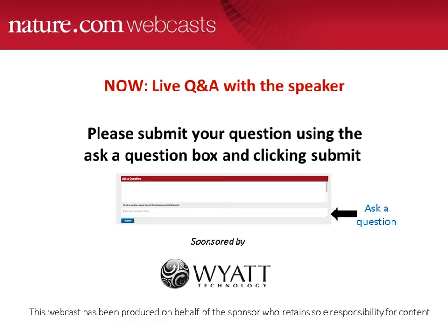Excellent. Thanks, Eva. And our next question asks, how do you determine the frictional ratio in DLS experiments? So this is a combination of both DLS measurement to measure hydrodynamic radius and static light scattering measurement to measure molecular weight, because one needs both of these to compute the frictional ratio. From molar mass, one can compute what would be the radius of a sphere with the same mass and density, and then you compare this radius to the hydrodynamic radius that was measured from the DLS. So both measurements are needed, to determine the molecular weight and to determine hydrodynamic size.